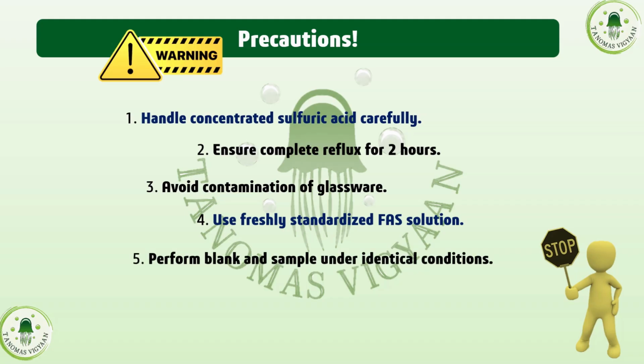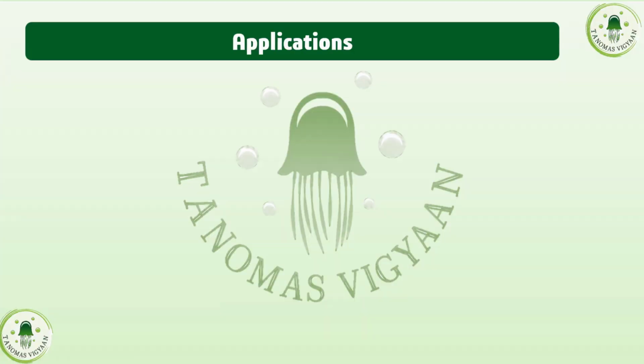And then precaution number 5 is perform the blank sample under identical conditions. Okay, so keep the conditions same for both the sample and for the blank to carry out the experiment smoothly and to get the proper reading of the COD. So these are the precautions.